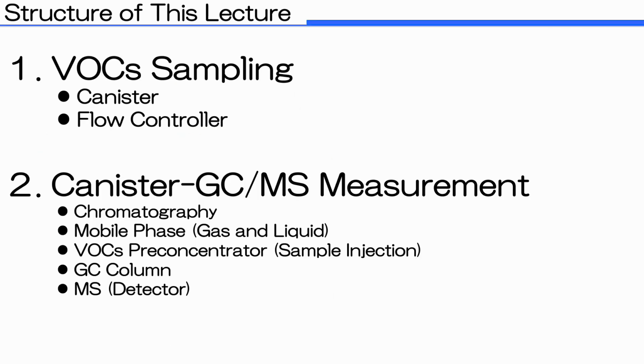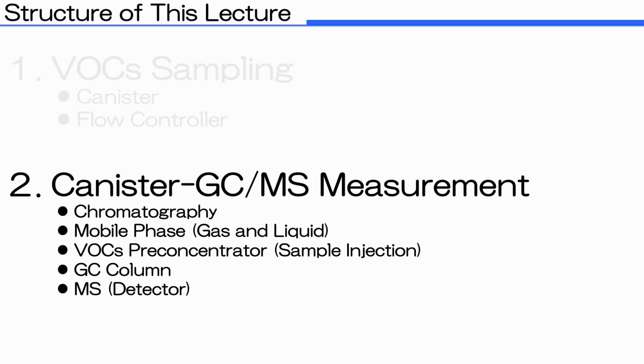That is all for the first topic, and I will move on to the second topic, and this part is about canister GCMS measurement.